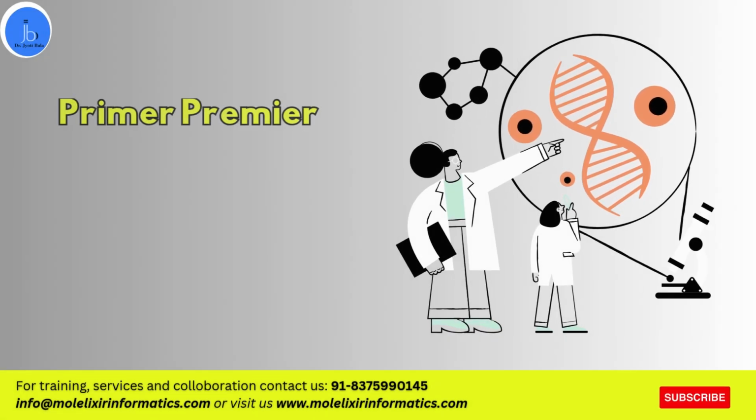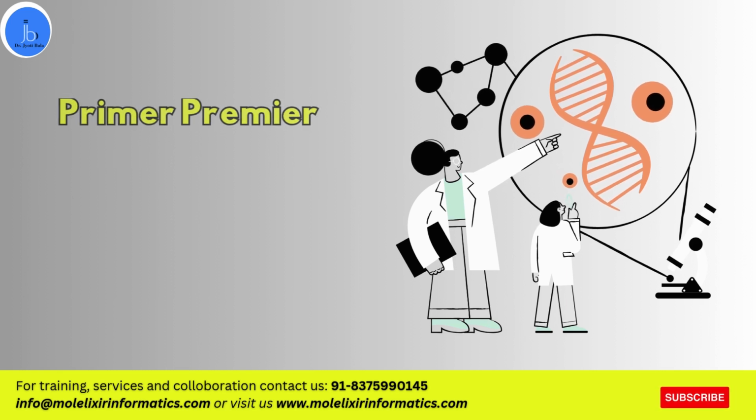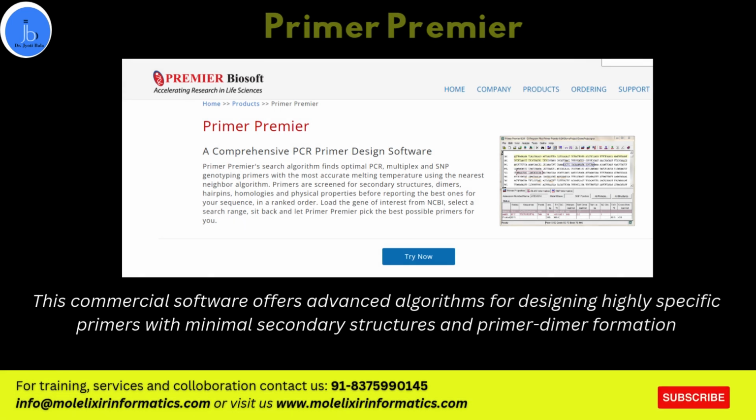The next one is Primer Premier. This is a comprehensive primer design and analysis tool. This one is commercial software which offers advanced algorithms for designing highly specific primers with minimal secondary structure and primer dimer formation. It supports a wide range of applications including SNP genotyping and real-time PCR.